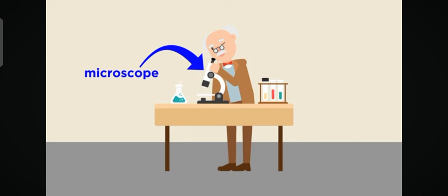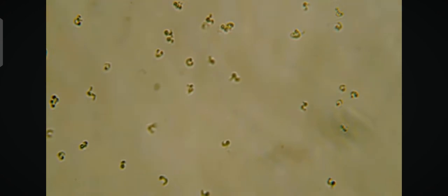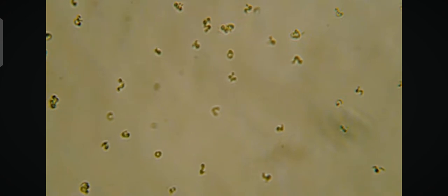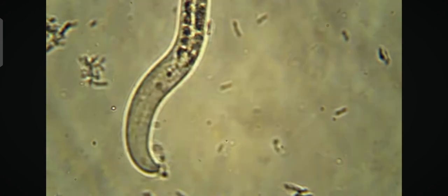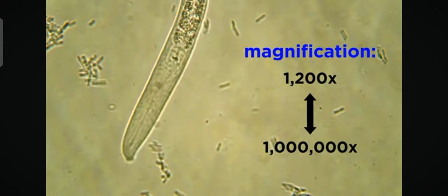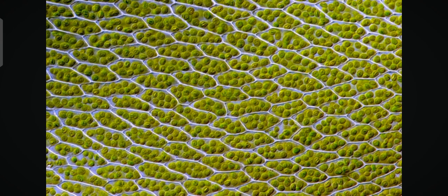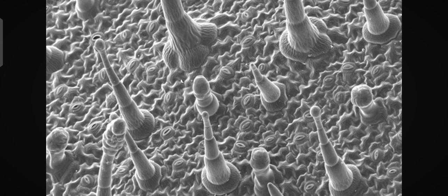the microscope. As we learned at the very beginning of this series, microbiology is the study of microscopic organisms, and to study this otherwise invisible world, microbiologists use microscopes. This tool allows scientists to observe microscopic tissue and organisms with magnification ranging from 1200 to 1 million times larger than its original size. But how exactly did we get from examining a specimen simply by pulling it very close to our faces to being able to look at a screen of a sample enlarged enough to study the details of proteins within a single cell?